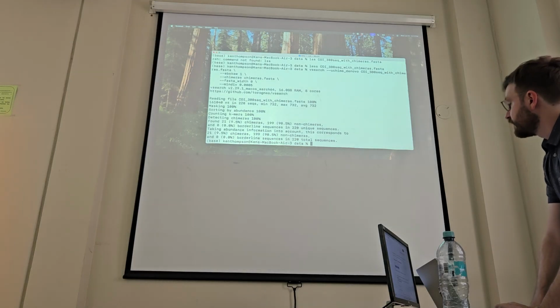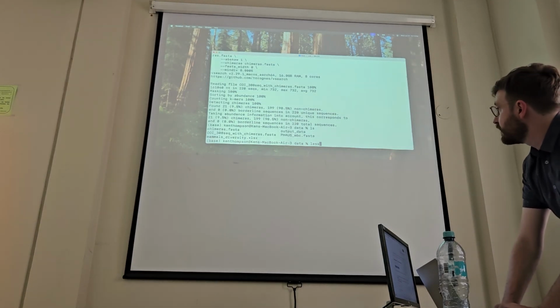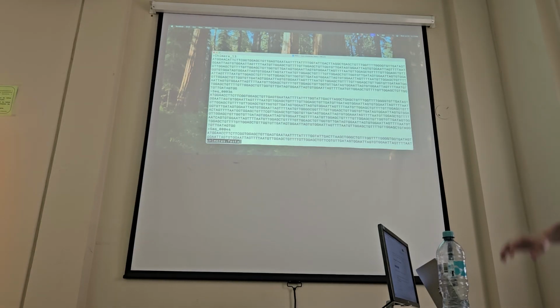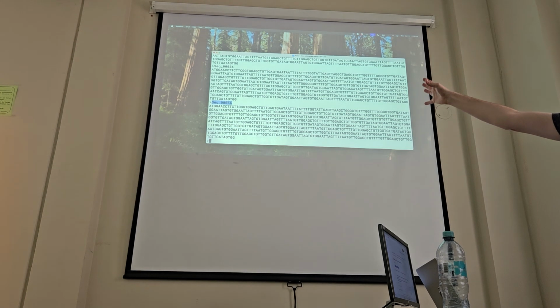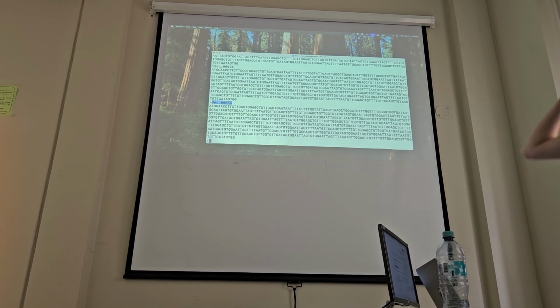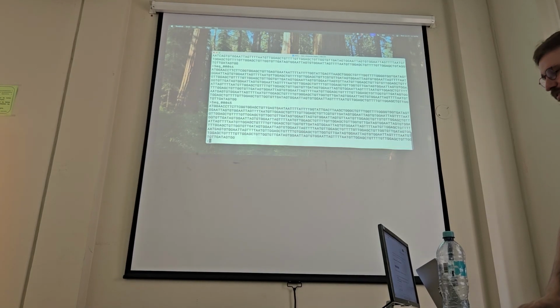And then what we do is we can look at the file we made. And so these are the ones that it said were the chimeras. So we could say, okay, these are the chimeras, and then we can remove those from our other data set. Okay? So that's the basics of metabarcoding bioinformatics.